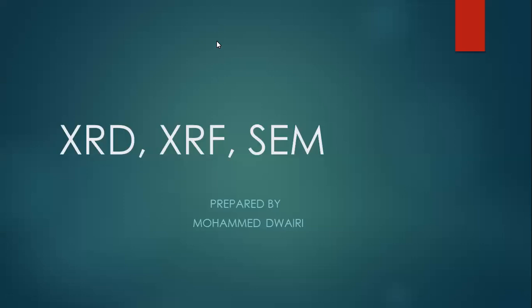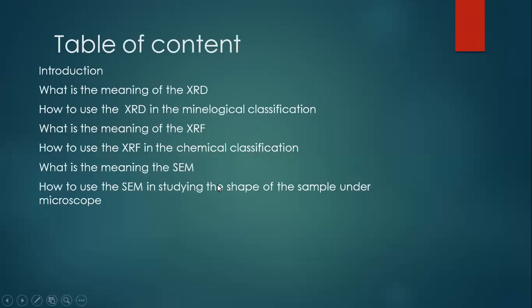And I hope that after we finish talking about this course, all the participants will have information about how to deal with XRD, XRF, and the scanning electron microscope. So before we talk about XRD, XRF, and the scanning electron microscope, we shall say what we want to talk about in this course.